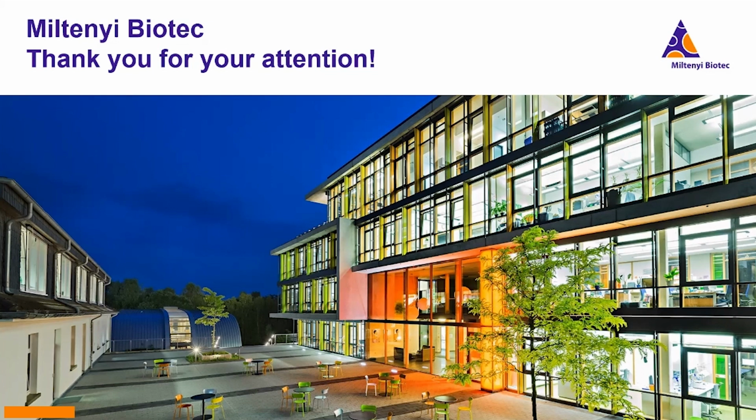It would be great, and we will probably come up with a solution so that you can use xylene alternatives. I don't have any names in my head which you could use as an alternative, but there are already some beta tests running where we are testing xylene alternatives, and maybe that will be part of an upcoming protocol revision in the future.